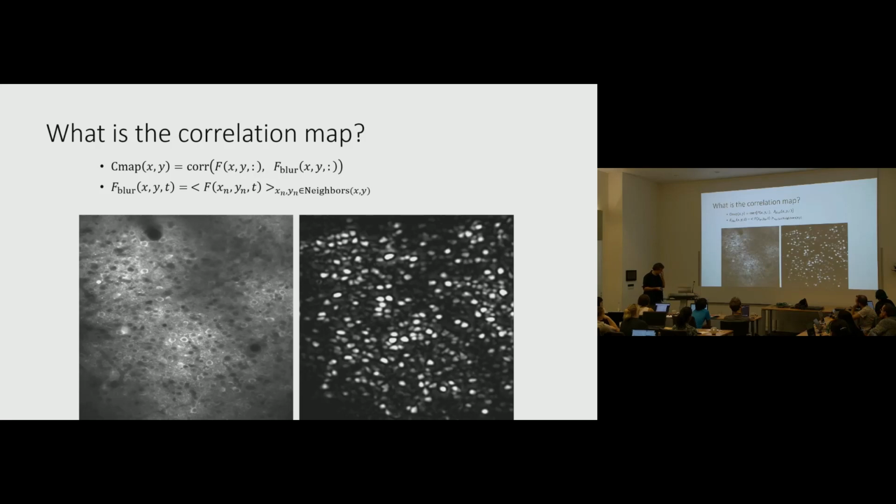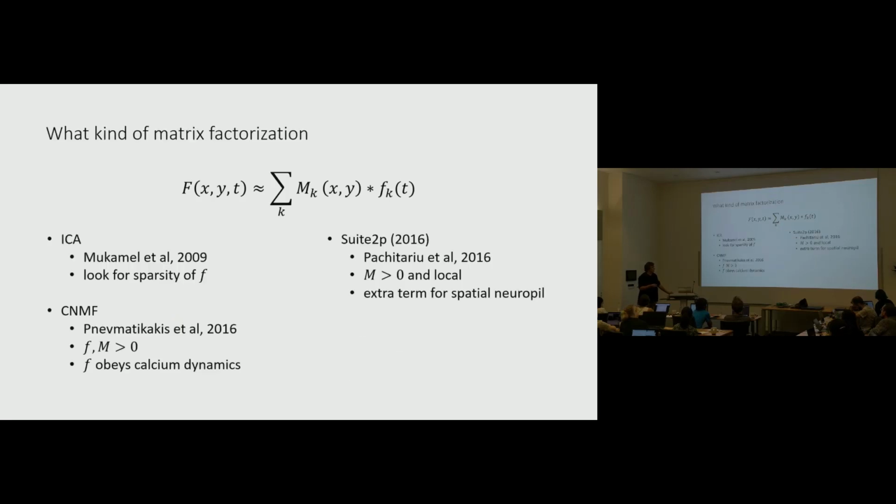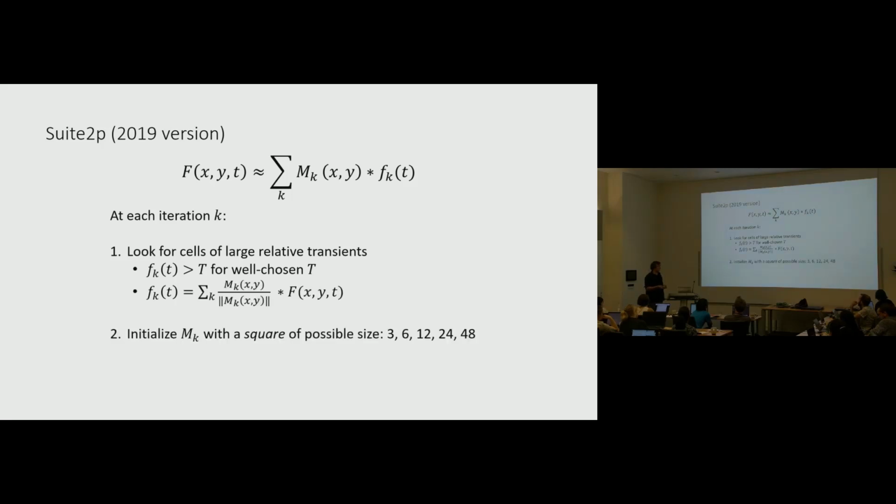And so the way we pick this threshold automatically is as a function both of the spatial scale of your ROIs, which we estimate, or you can enforce it yourself if you want, but the estimator works fine. And then it's multiplied by the average SNR of these first blobs that we collect from the image. So as we start peeling off more and more ROIs, it sees that the first 100 ROIs had a brightness that was relatively, I don't know, 100. And so it says, okay, I'm going to stop at anything that's like a tenth of this or something like that. We have to look through the code to tell you exactly if it's a tenth or some other way of determining, but that's the rough idea, that it's scaled based on your brightest sources.